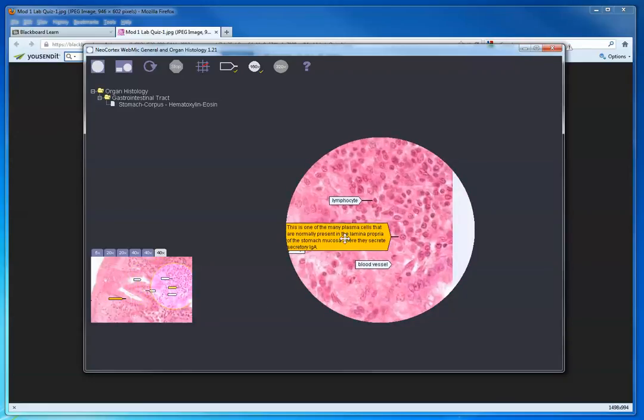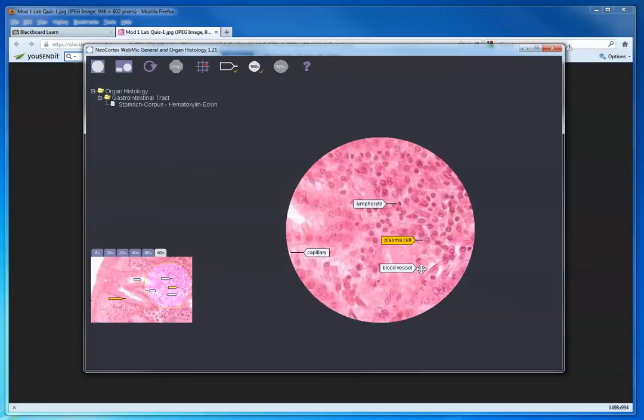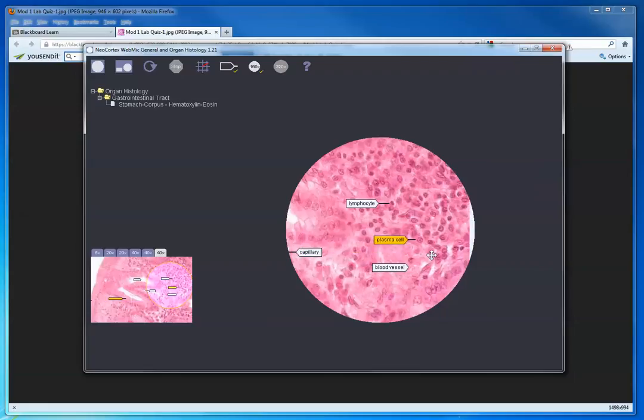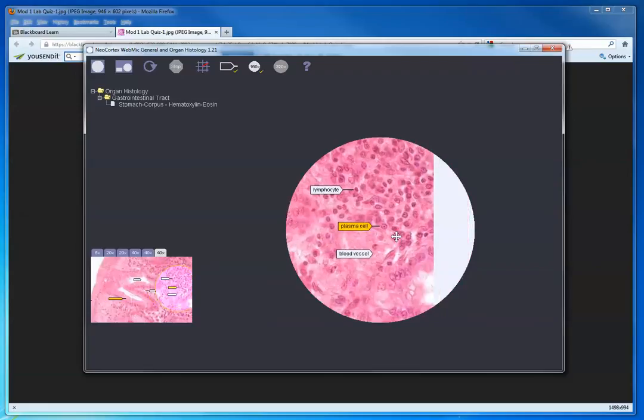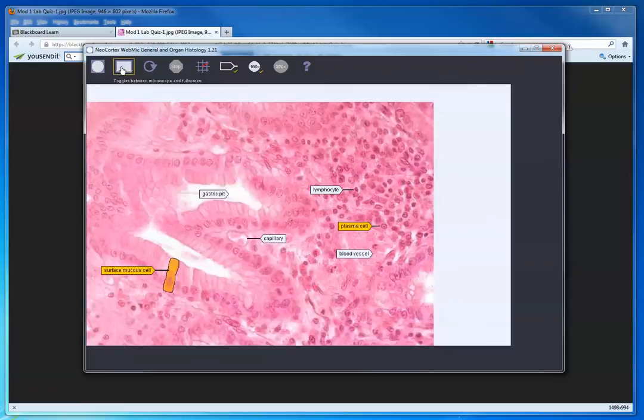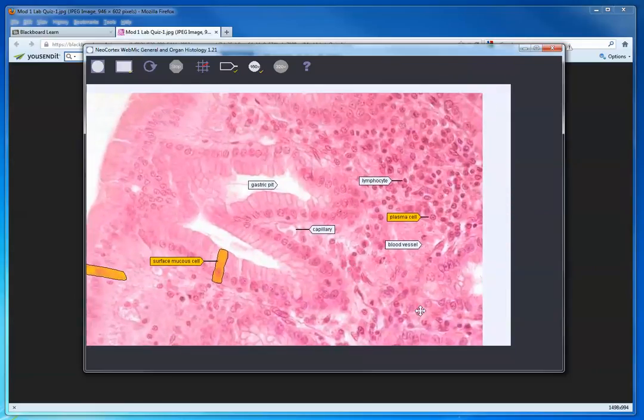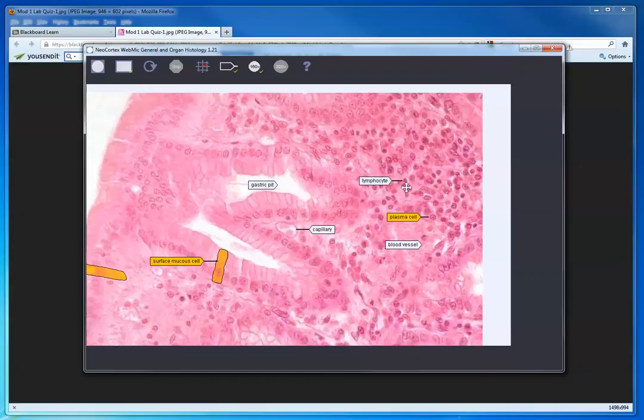You can read a little bit about the plasma cell. It says it's found in the mucosa of the stomach and throughout the GI tract, secretes secretory IgA, and notice the clock face nucleus. You have a dot in the center and a pattern around the edge like clock numerals—that's what we mean by that. I can zoom in like this, and if you look around you can compare that to a lymphocyte. A lymphocyte doesn't have a pattern; it's just a dense, dark-stained nucleus.